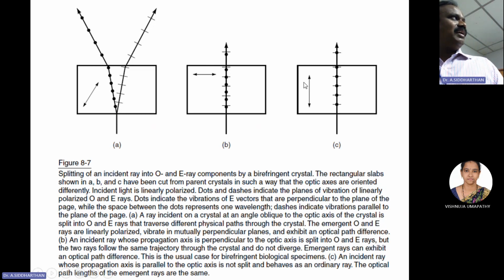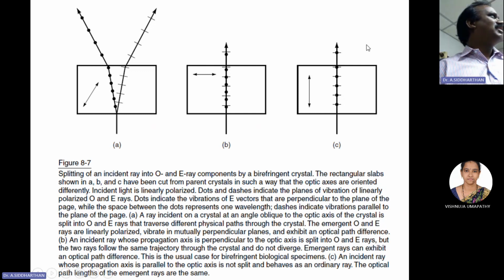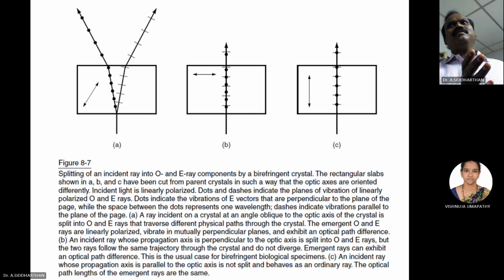If it is perpendicular or parallel to the incoming light rays, what is happening here? The path is not modified, but there is something happening. What has happened here? The dot is not placed at this dashed line. That means retarded. One vibration is getting retarded when it goes to a particular point. Okay, one vibration front is slowed down. This vibration front is going without any disturbance.